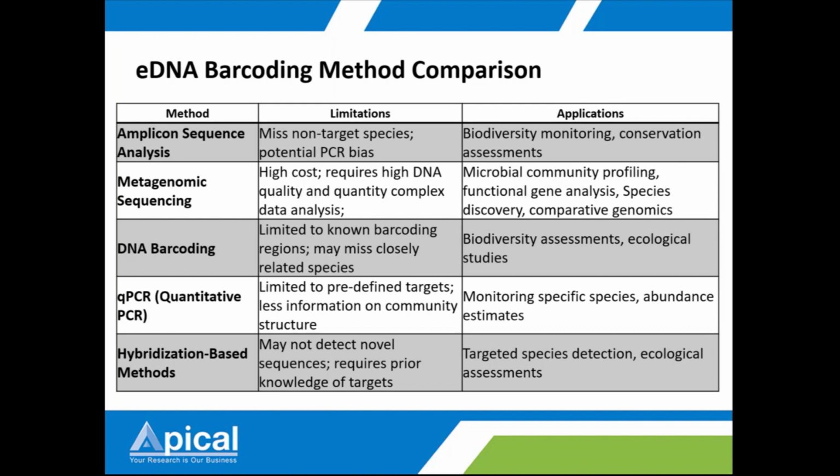have information prior to having this hybridization kit. Otherwise, you might miss your target organism. So required prior knowledge of the target is very important. This is useful for targeted species detection and also ecology assessment.